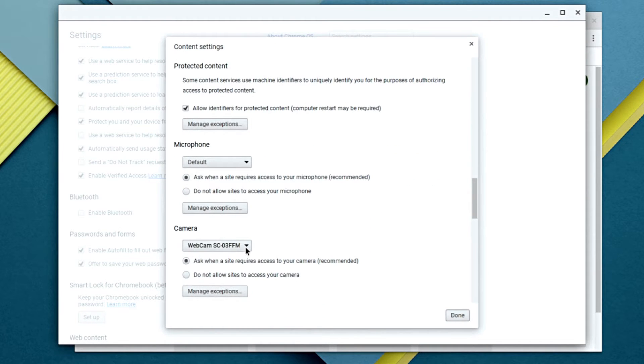Scroll down under Camera, click on the drop-down menu and select the Dynolight, then click Done. The Dynolight will now display from the built-in camera application.